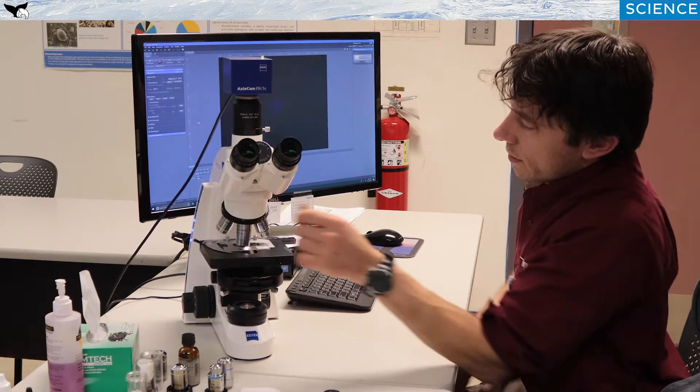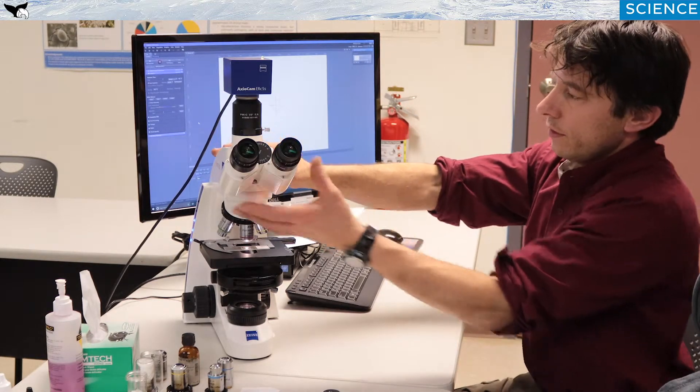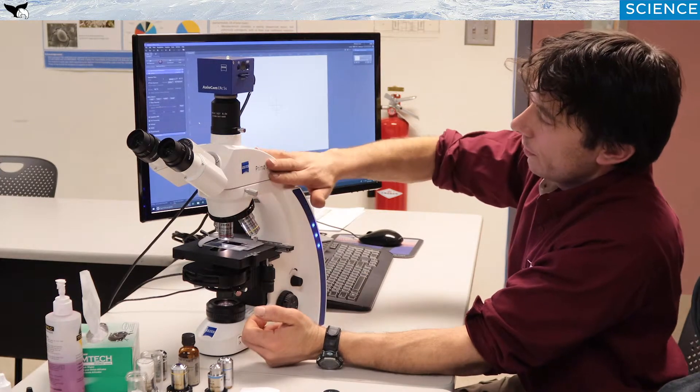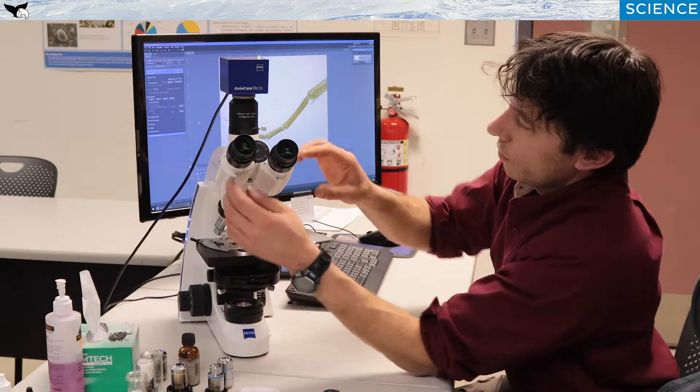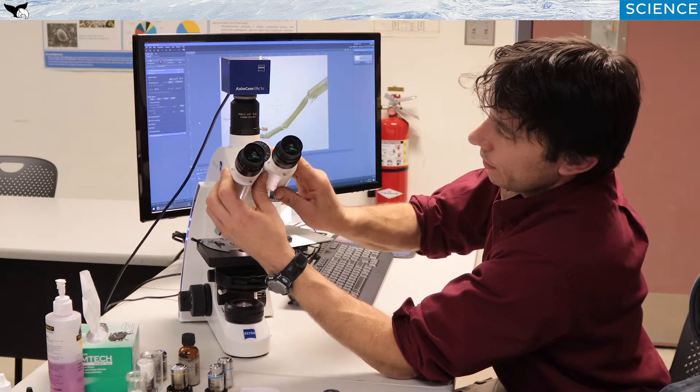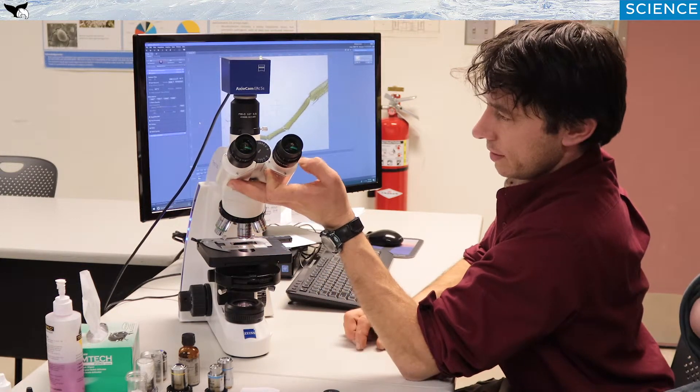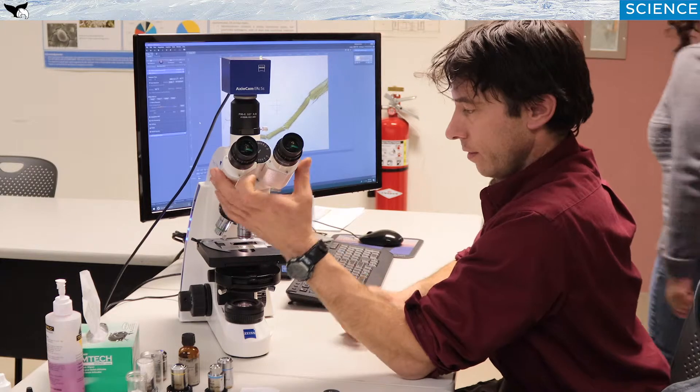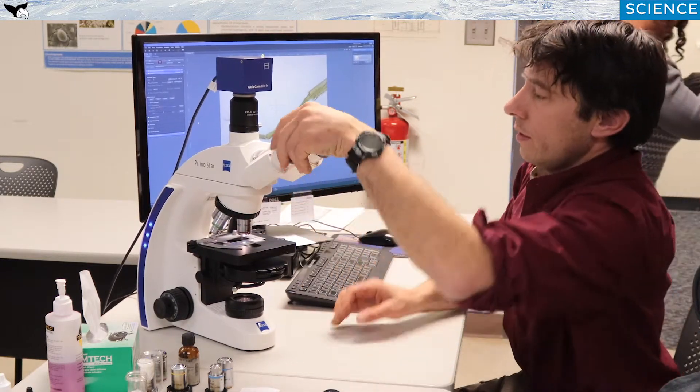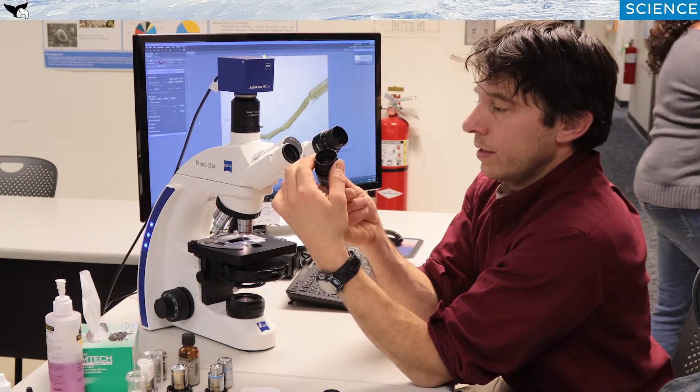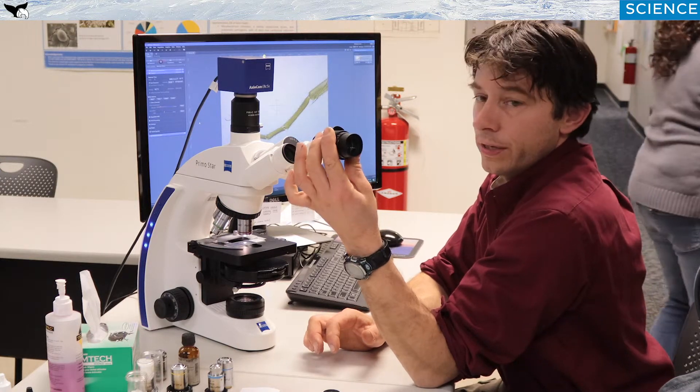Moving up, you can rotate these. It's called the objective turret. Above this, we get into this part we call the head tube. This one particular has an extra port on it for a camera. Most microscopes you'll have will either have one or two eyepieces. More advanced ones will have two. Simpler ones will have a single called a monocular microscope. This is a binocular. And on the end of it, whether you have a single or double, you have one of these called an eyepiece ocular or just simply an eyepiece.